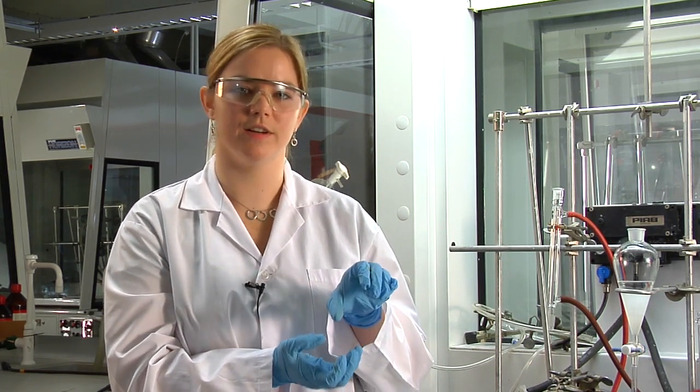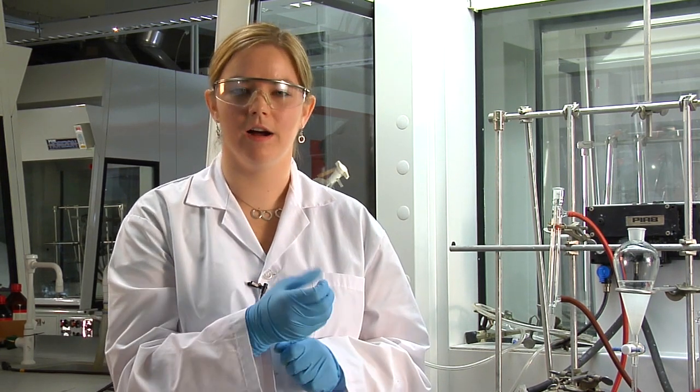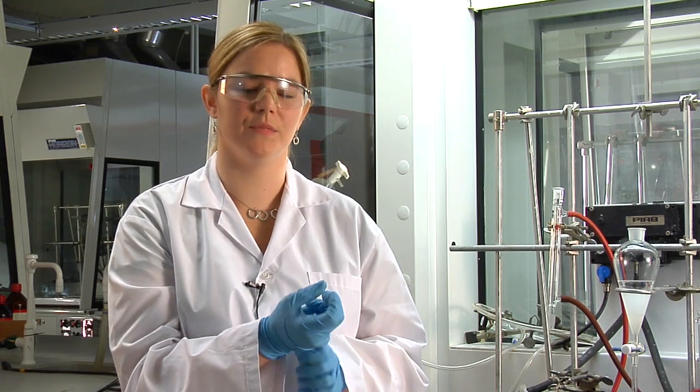And once you've done that and you just have your organic phase remaining in your separatory funnel, you're going to be filtering that through a cone with sodium sulfate, a drying agent, just in case, to remove any excess water that might be in there. And then you're going to be taking that ether phase in a beaker over to the steam bath and just evaporating it dry. And that's going to be the isolation of your compound, and you can save that for the second week of the lab.